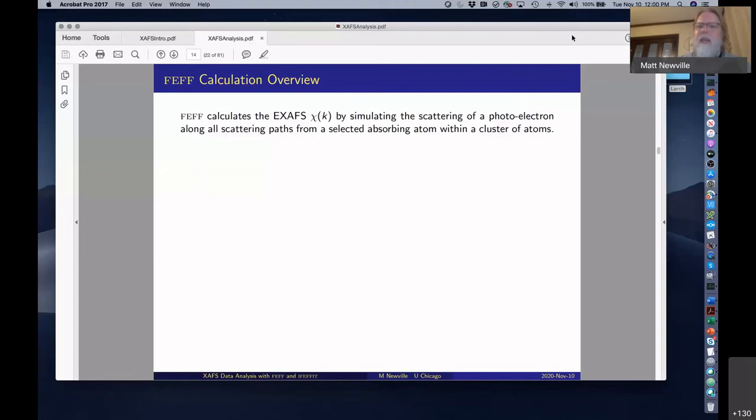Those take into account, at least partially, the log of the likelihood, so they are often used as slightly better than simply the reduced chi-square. Best reduced chi-square is what I learned a while back, like 20-something years ago. Reduced chi-square is like the start. And if reduced chi-square is different than R factor, I don't know what to tell you. But I would probably defer then to these Bayesian and Akaike criteria.